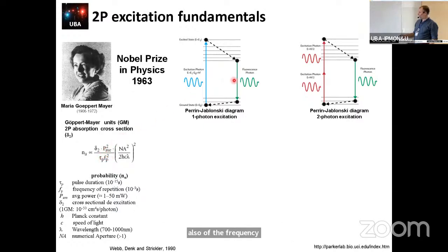And if we review in the literature the difference between two-photon excitation and one-photon excitation, in the Jablonski diagram, as Dave showed before, we have a fluorophore in the ground state, and when we hit this fluorophore with the proper light, it will excite, and then after some fast reorganization, it will fluoresce, and this cycle will go over and over until we damage the fluorophore.